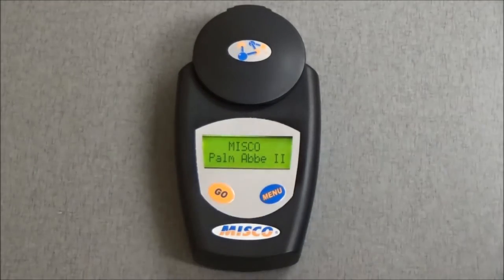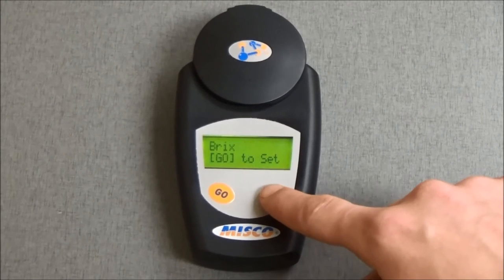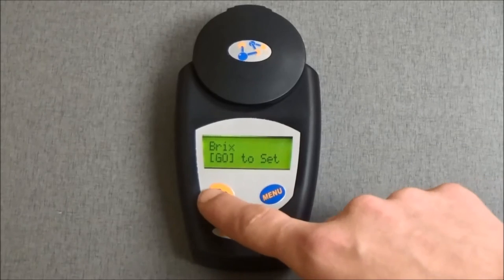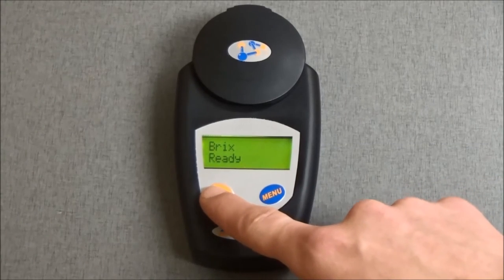Next, press the Menu button repeatedly until the screen reads Brix, Go to Set. Then press the Go button to select the Brix scale.